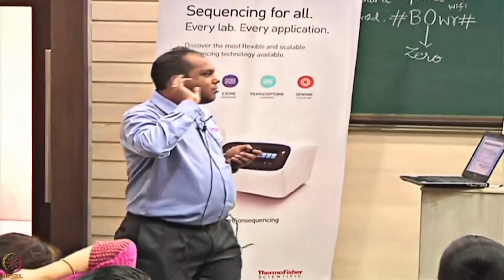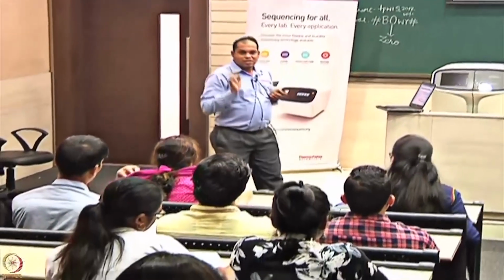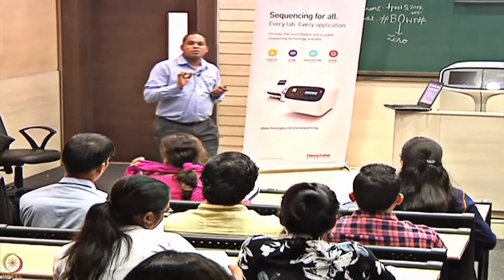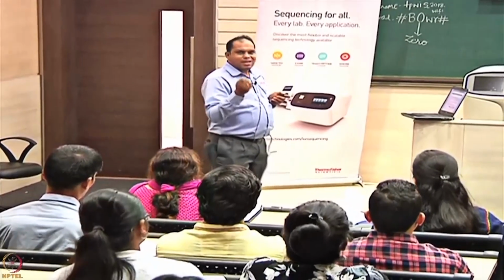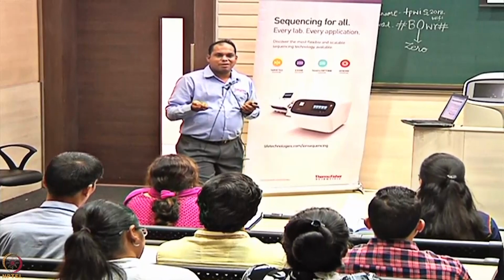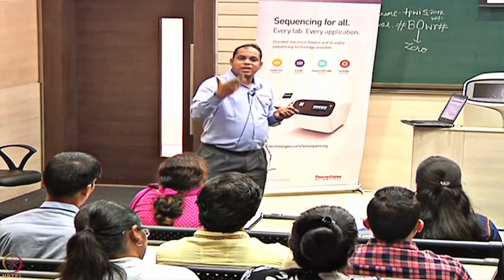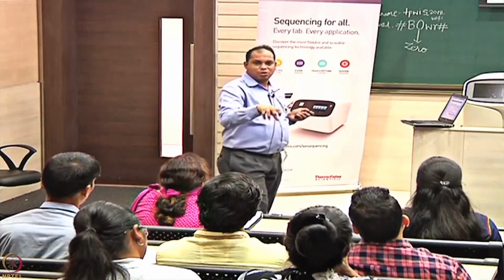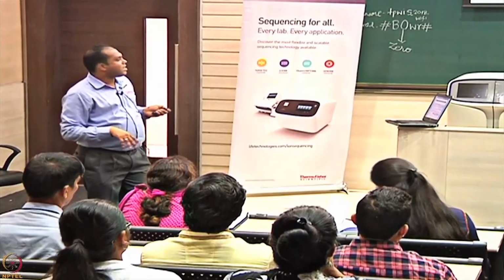So whenever you do a cancer test or somebody is detected with cancer, these samples are actually fixed in paraffin, right? And then sent across to labs for testing. So these can be easily picked up. We wanted to know what variations or mutations you are getting in it. So such studies could be done again using a particular design over here.